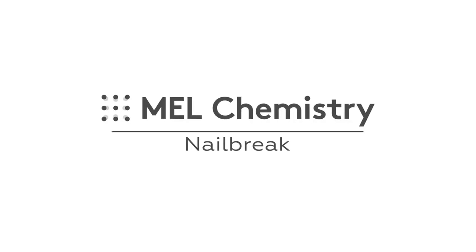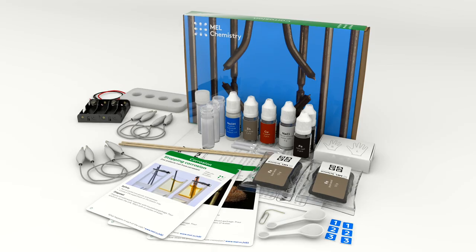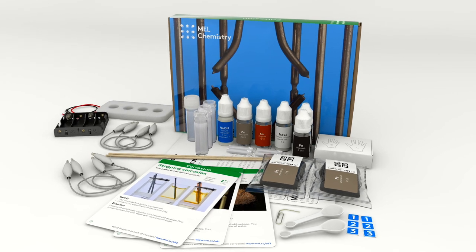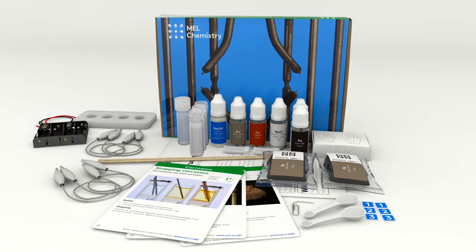Welcome to the wonderful world of chemistry. Today, with the help of the corrosion set by MELchemistry, we will break a nail with our bare hands.